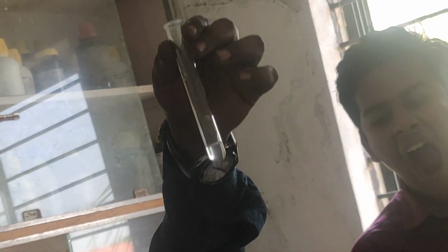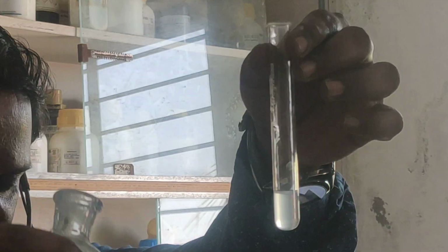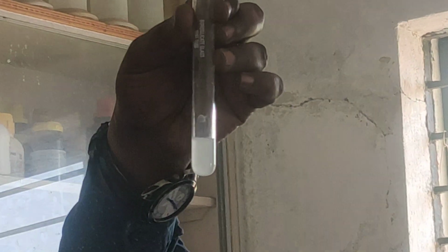When I add ammonium oxalate, you will get a white precipitate, and Ca2+ is confirmed. You can see the white precipitate slowly settling down here. So with this, calcium is confirmed. Right, all of you?